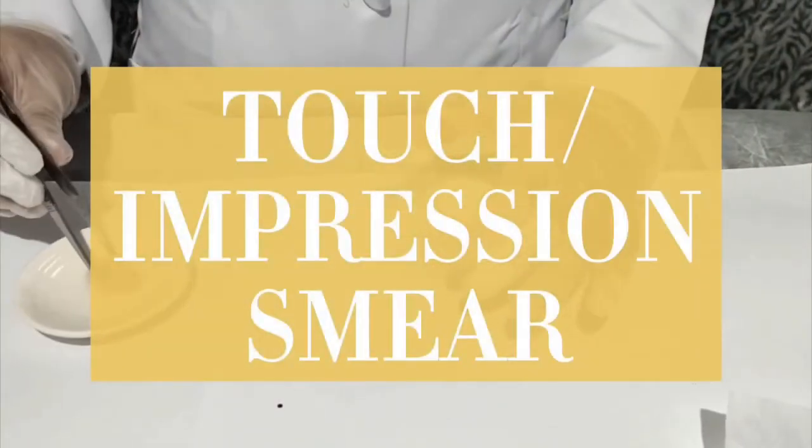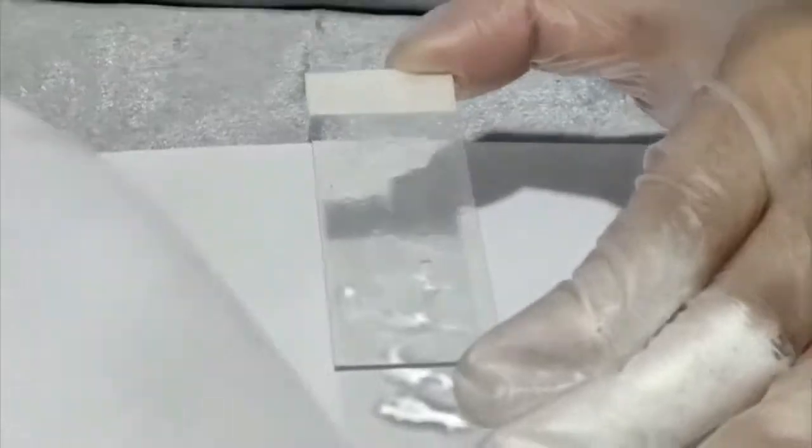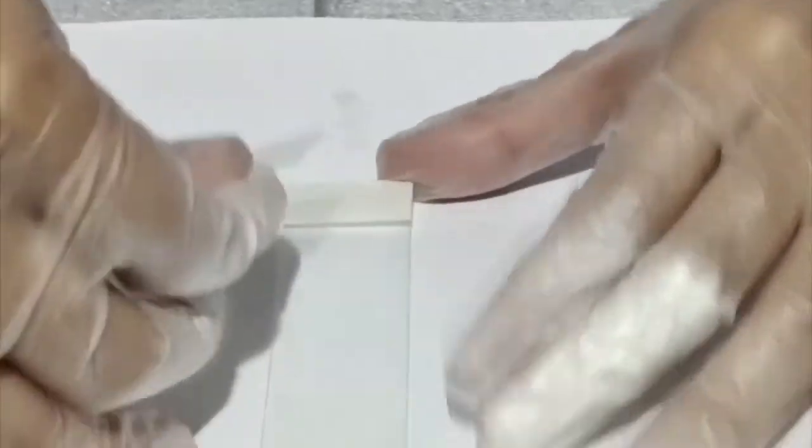The last method that we have is the touch or impression smear. Allow the freshly cut surface to come in contact with the surface of the glass slide. Apply gentle pressure, allowing the cells to be transferred directly to the slide. And then, cover the smear with a cover slip.